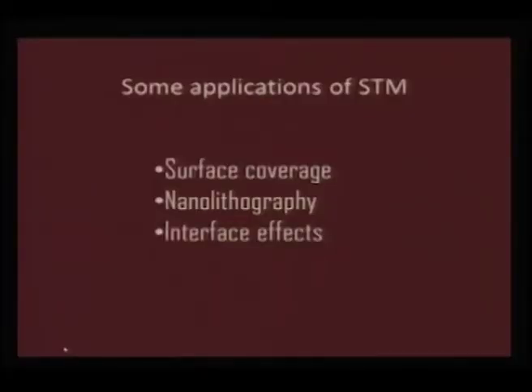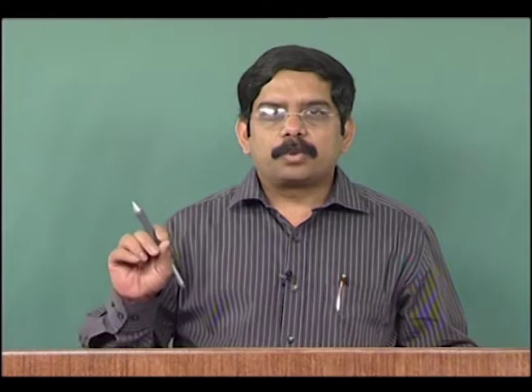I will give you some idea about the applications of STM. Once you probe, what is all that you can look for, and from our own experience I would like to quote a few details. One of the main applications of STM is in ultra high vacuum environment, where you try to control depositions at the atomic level.